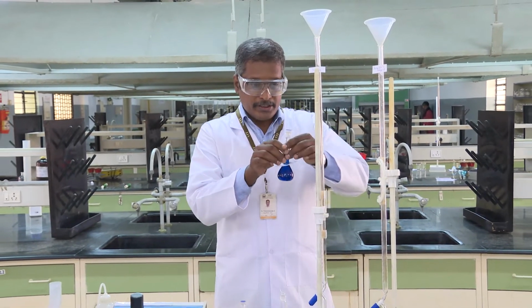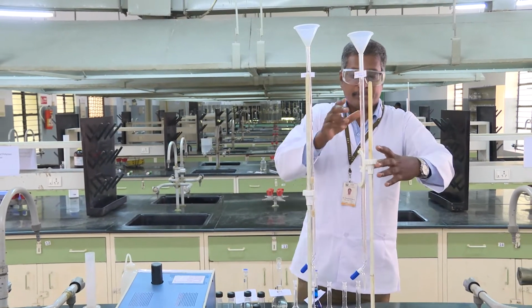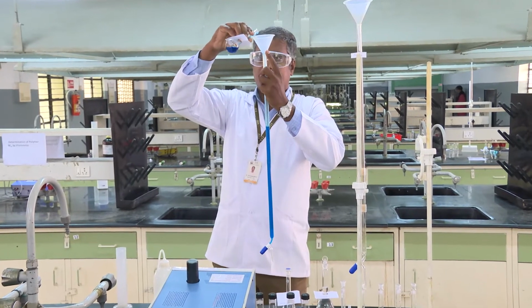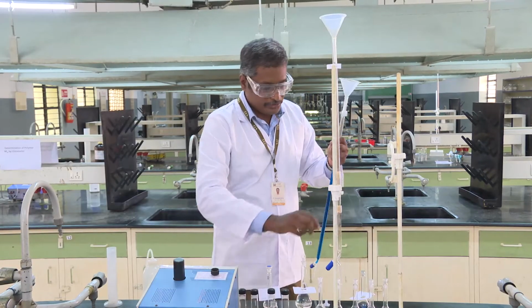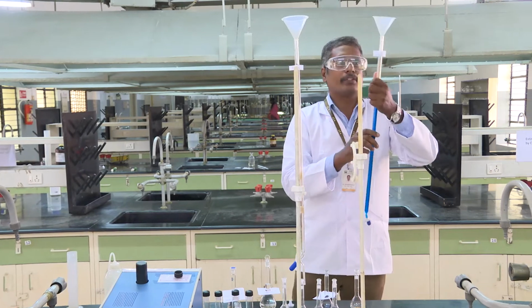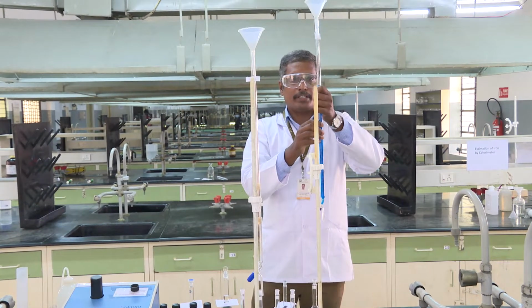Okay, so for that we need to use a burette. Let's fill this burette. Since we are going to take 0.5 ml, we are going to add it in this. Sorry, we are going to use the standard flask, 0.5 ml.